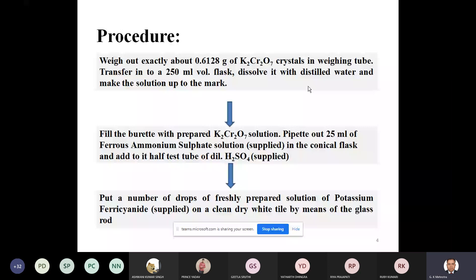On your shelf, you are provided with the unknown solution and the intermediate, that is ferrous ammonium sulfate. The indicator is also there. This is a unique indicator used externally, which is very interesting. This titration can also be carried out with an internal indicator, but the external indicator gives 100% correct results up to the fourth decimal place in grams per liter.